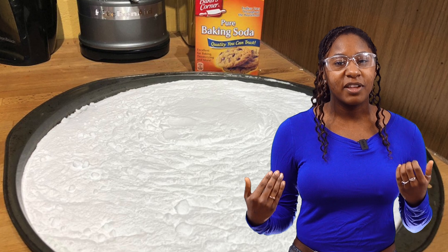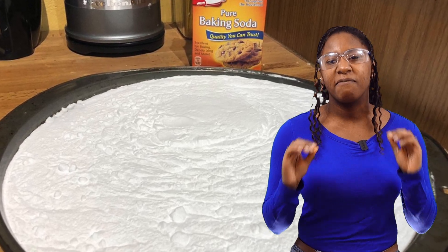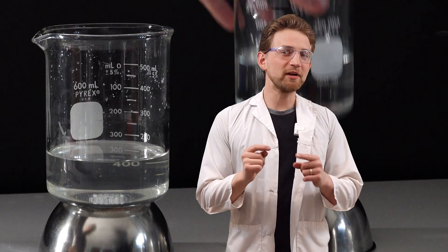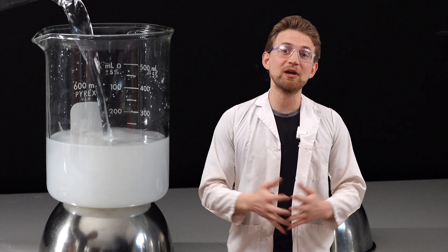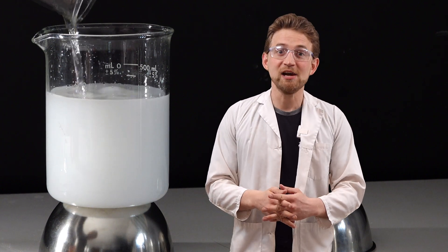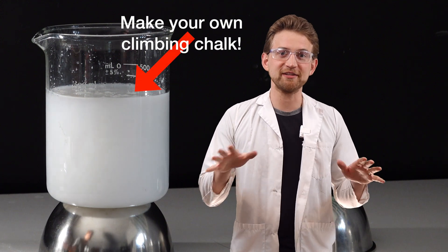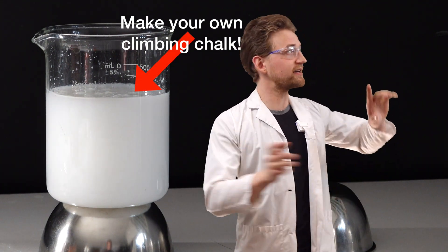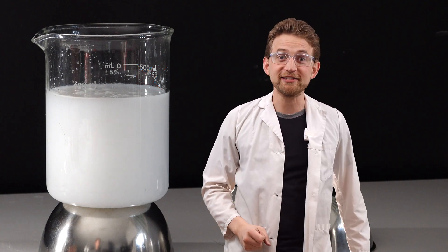carbon dioxide, and a little bit of water that gets evaporated in the oven. When you take it out, it's going to look exactly the same but is a very different substance. If you wanted to see the difference between sodium bicarbonate and sodium carbonate, you could mix up a batch of magnesium carbonate — a really cool substance that is completely non-water-soluble. Go check out our video on magnesium carbonate, it's awesome.